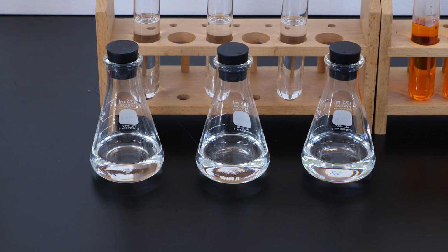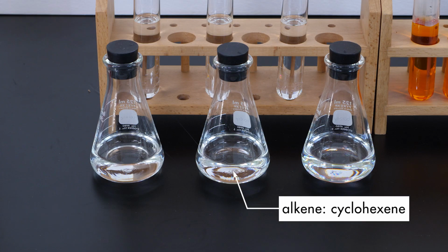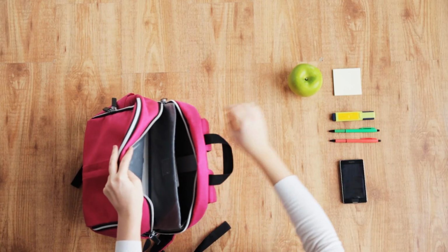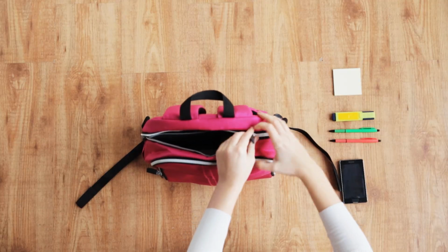A simple test can be performed in the lab to determine whether a hydrocarbon is saturated or unsaturated. For this demonstration, we will use 3 liquid hydrocarbons: cyclohexane, which is an alkane, cyclohexene, which is an alkene, and benzene, which is an arene. Cyclohexane is used in the production of nylon, a synthetic fabric used for many things, such as this school bag.